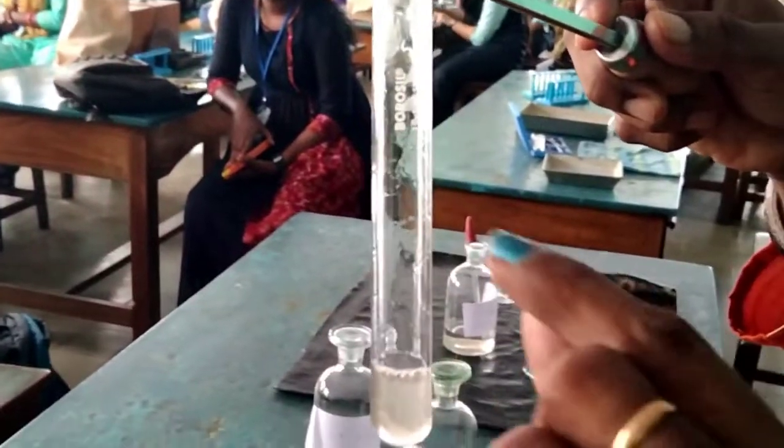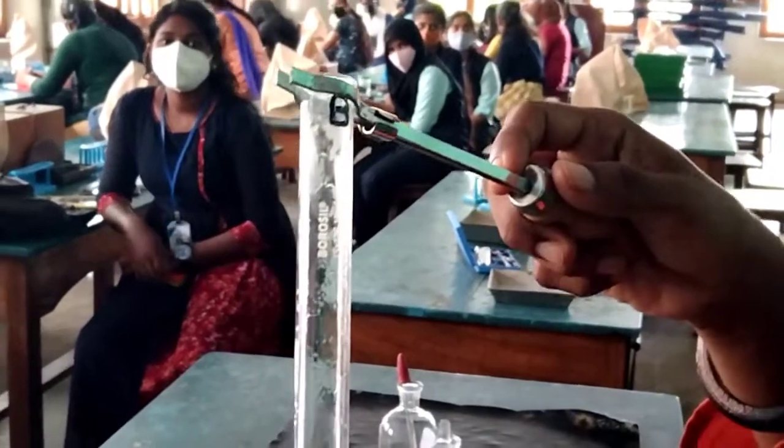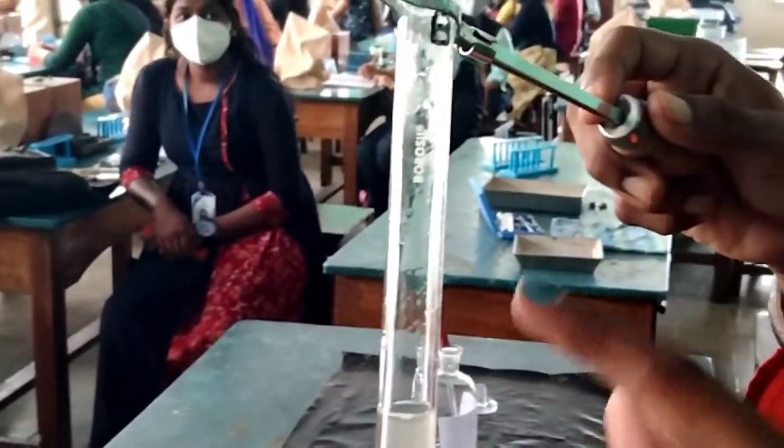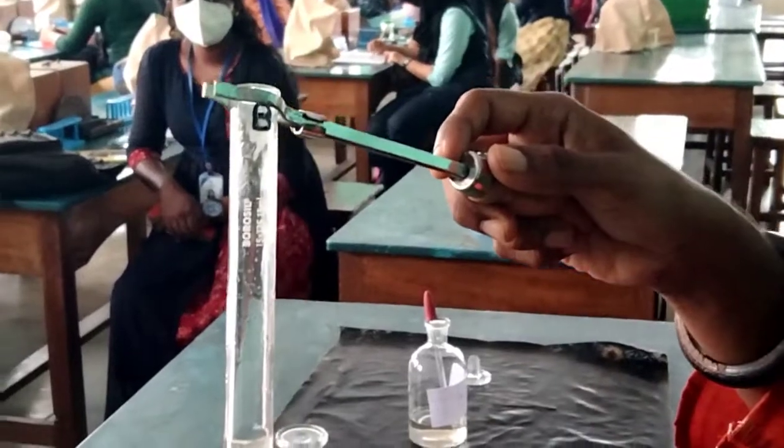Now you can see sand-like particles on the sides of the test tube. When you see this, you can understand that the scales have fallen off from the skin. Can you see the sand-like particles on the test tube? Those are the scales.